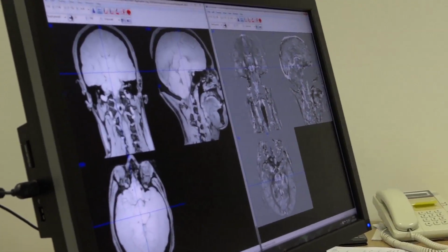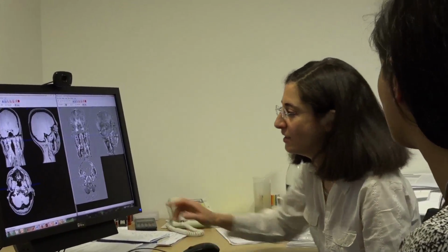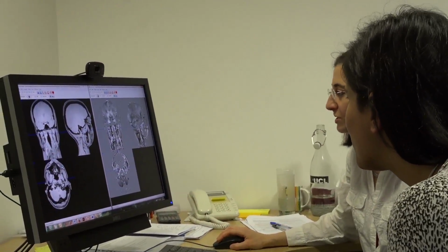So there are 3 strands to the project. The first strand is to design and construct tumoroids with realistic oxygenation levels just like tumours. The second strand is to optimise high-resolution MRI susceptibility mapping techniques for imaging these tumoroids. And the third strand is to perform optode oxygenation level measurements in the same tumoroids and compare them with the values that we get from our MRI susceptibility mapping measurements.